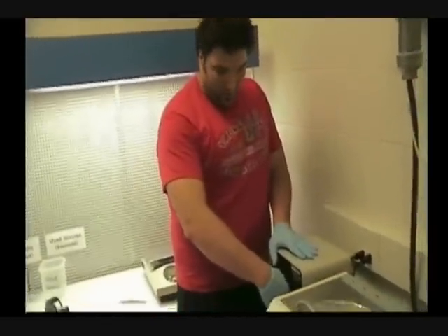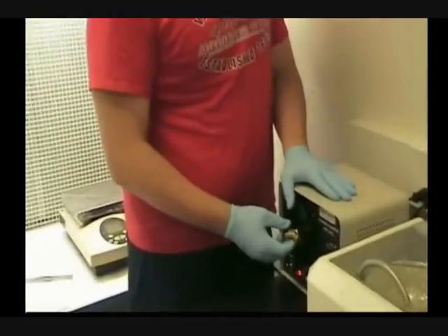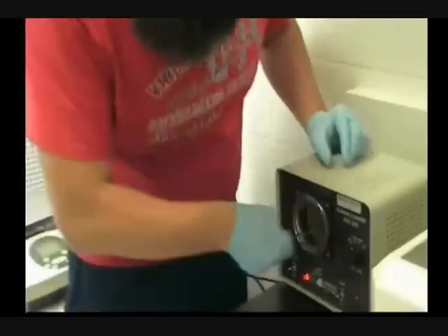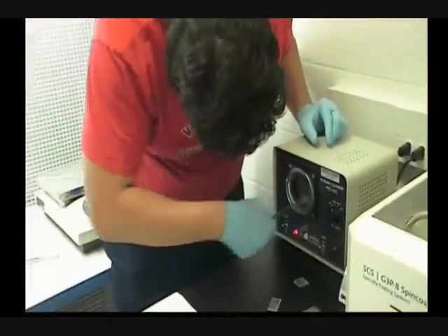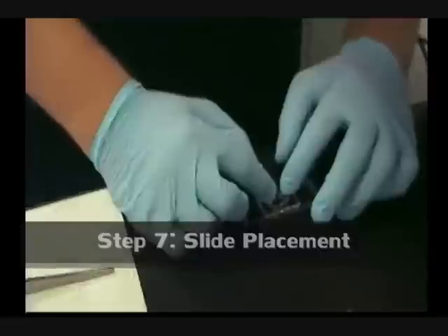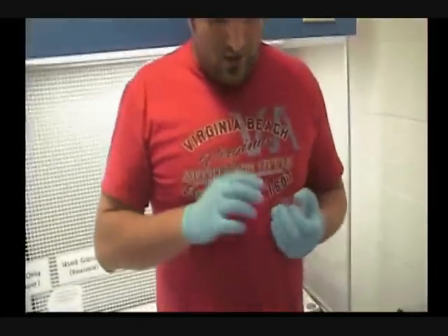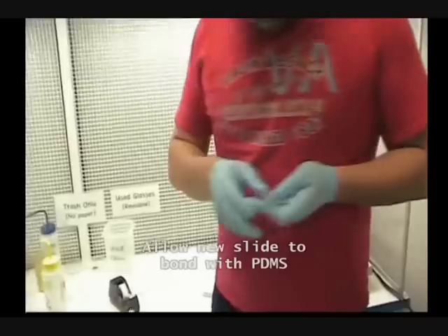Now they are ready for bonding. And I am gonna place it here. Now I am gonna place this glass mat on top of my chip. And now the glass surface and the PDMS are bonded together, so I can remove the top one.